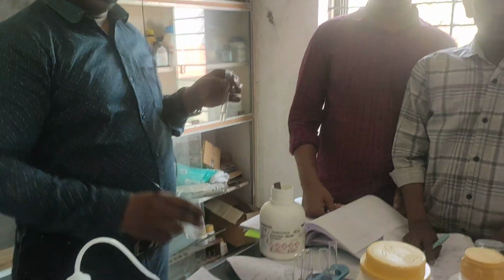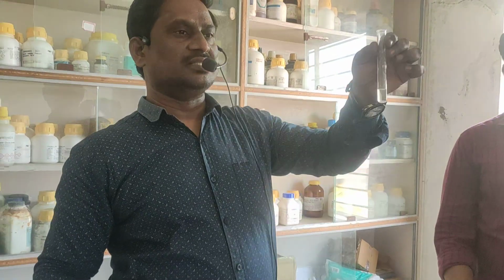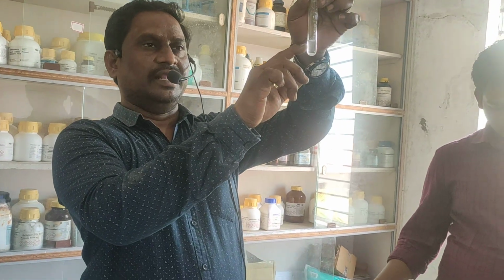Right, all of you? Next, third point: original solution plus NH4Cl plus NH4OH.